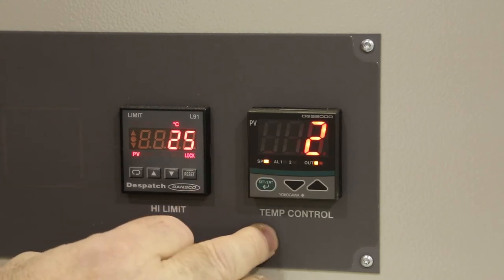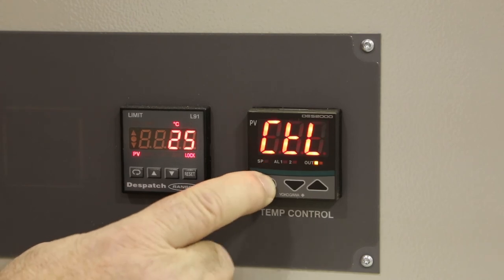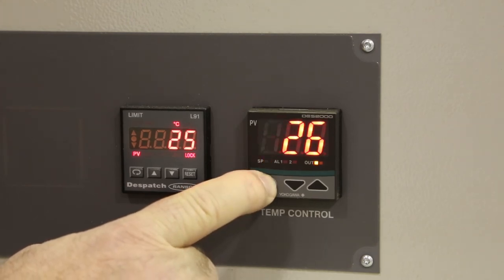Press the green button once to set the value and again to get back to LOC. Then press and hold the green button to exit the configuration menu.